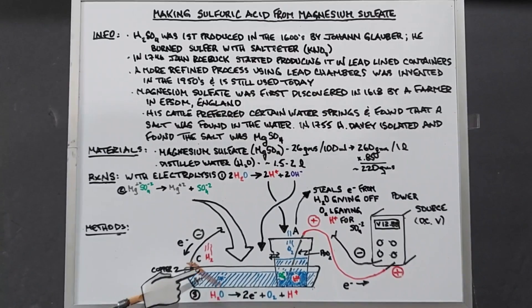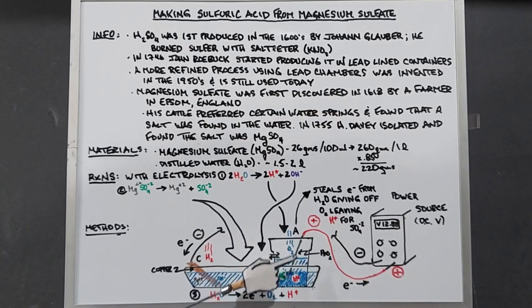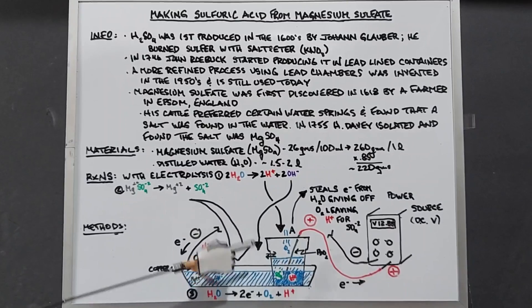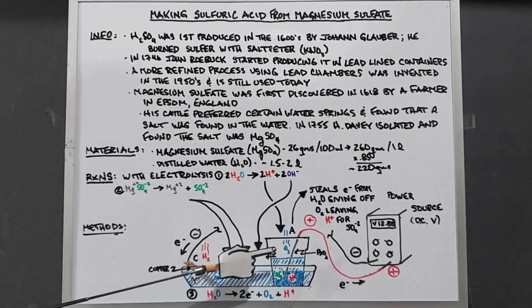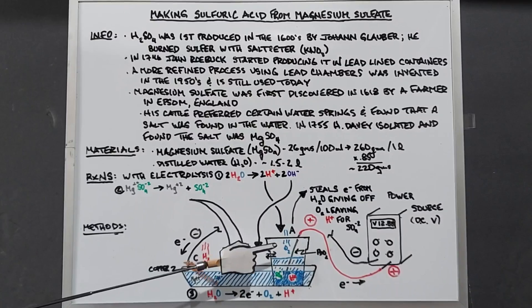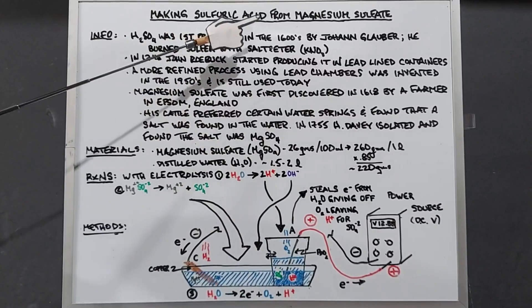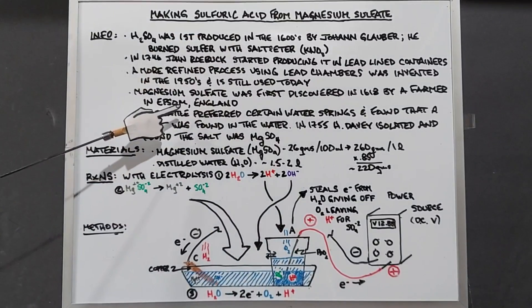At the cathode, you can use any metal because the magnesium hydroxide gathering around it doesn't break down and bother the solution—I'm using copper. At the anode, the lead dioxide electrode works really well for this reaction. If you don't have that, you can use graphite, but it tends to break down—you can filter it out when done. If you're very fortunate, you can use platinum. The pot cannot have any holes in it. Let's make some sulfuric acid from Epsom salts.